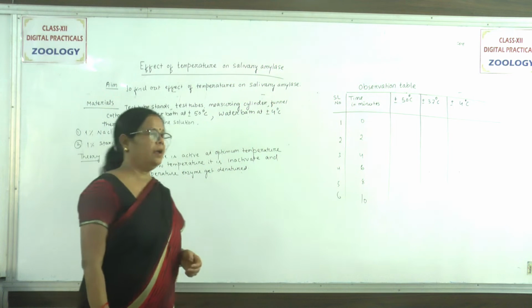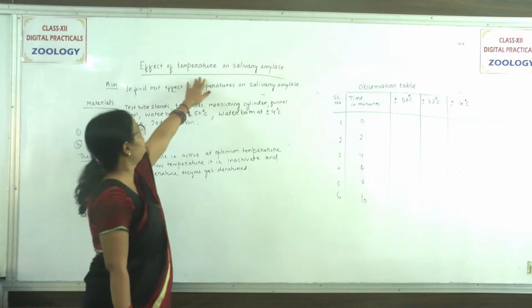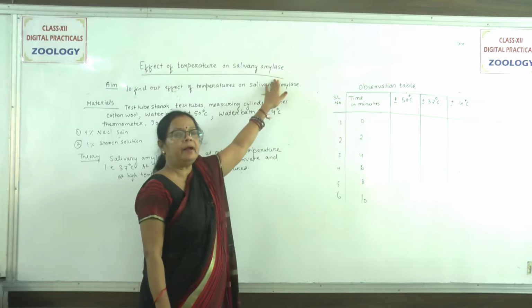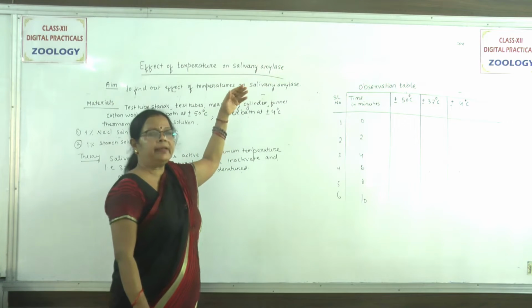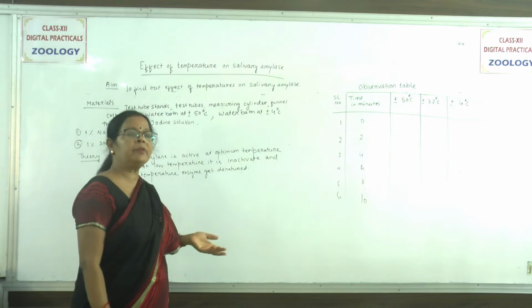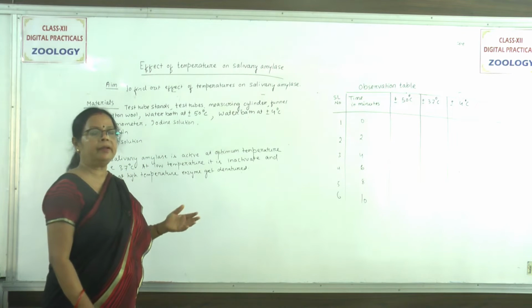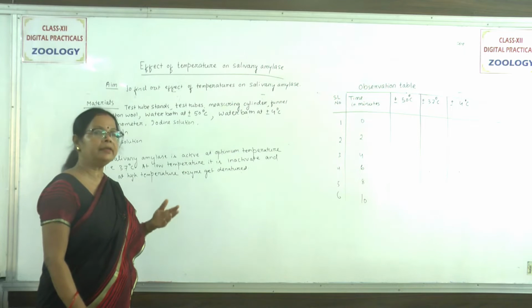Hello students, let us start with the experiment: effect of temperature on salivary amylase. Actually, amylase depends on temperature. An optimum temperature is required to activate amylase. Beyond that, it becomes inactive or denatured.